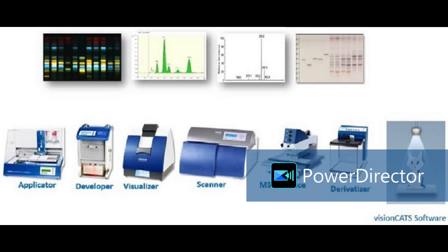We can hyphenate HPTLC with a mass spectrometer. Which analyzer is in the mass spectrometer? It is compatible with any make of mass spectrometer, like Shimadzu, Sciex, Thermo Fisher, Waters. It is compatible with any make, single quadrupole or triple quadrupole also. Any ionization mode, APCI or ESI, we can use. It depends on the properties of the molecule.